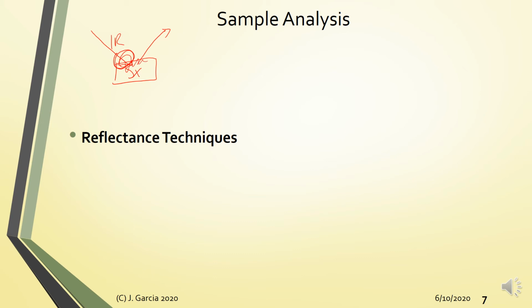So that means to say that we expect the energy of the incident radiation would be attenuated, so this would be greater than the energy of the reflected radiation. Alright, now here you measure the amount of the reflected radiation, so you call that term reflectance.